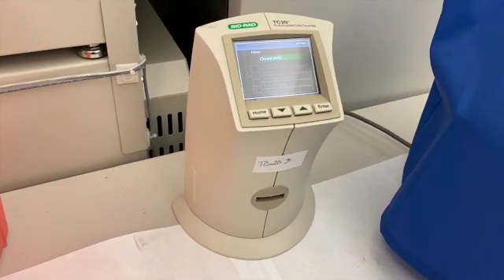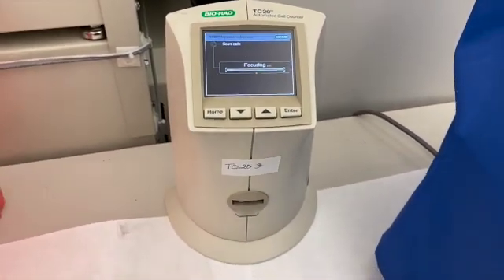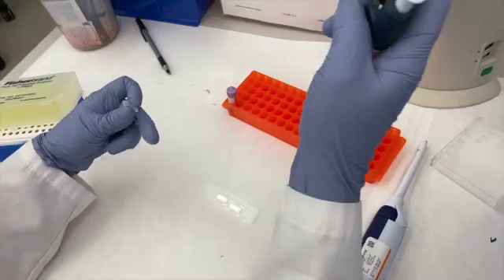The first step in initiating a culture is counting the amount of live white blood cells. This can be done using an automated cell counter. The live white blood cell count is used to determine the appropriate sample volume to inoculate into the culture. Some samples have an overproliferation of white blood cells, while others may have a very low concentration. This varies person to person and can change drastically throughout the course of a disease.